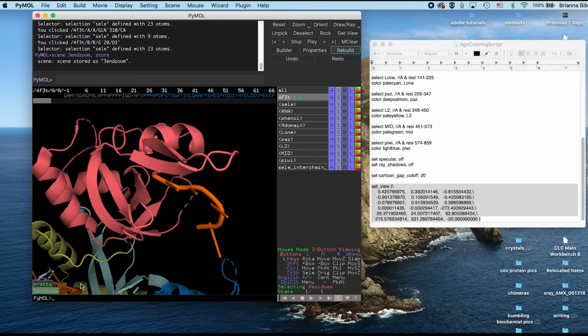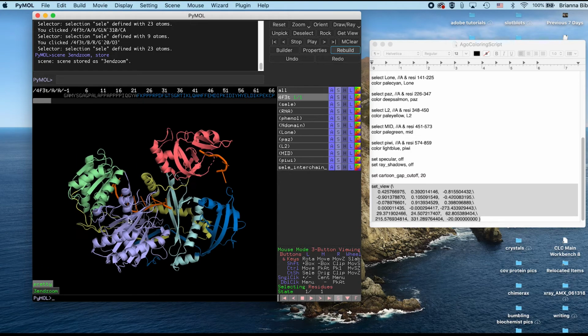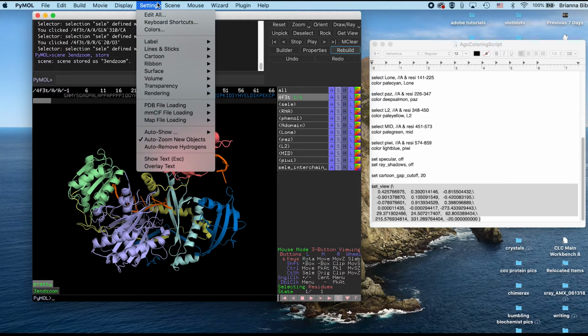And so we could do all sorts of different things in these different states, and then always go back to them. It's helpful when we make movies, as well as when there's some sort of representation that you don't want to lose. So yeah, there's a ton of different things. You really just have to play around.